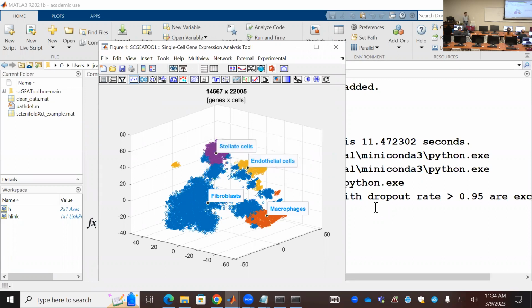We will discuss highly variable genes and their biological significance after the spring break. But this is a good way to sample your genes but keep the most important genes. The highly variable genes are the most important genes. So my matrix is much smaller right now. Much smaller.